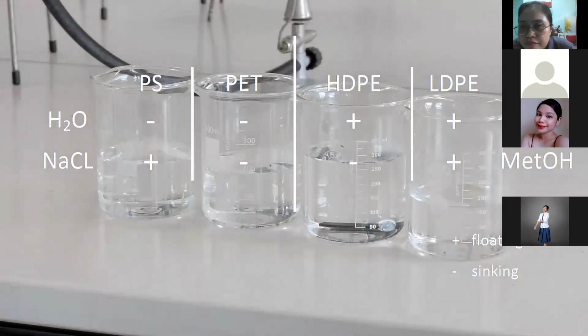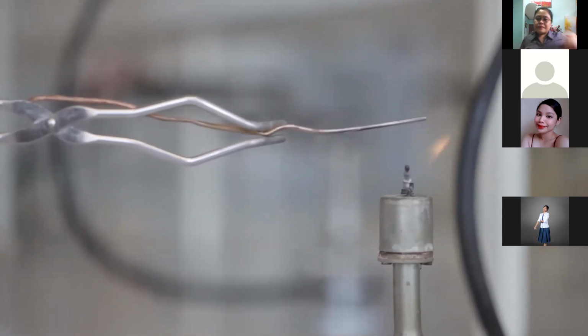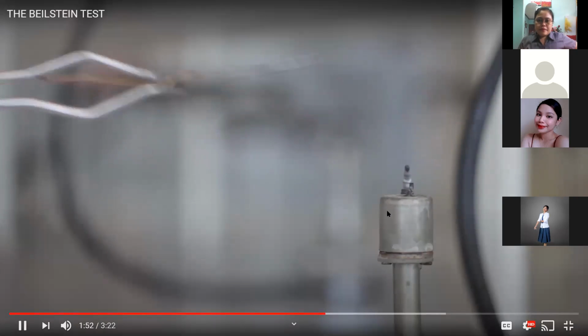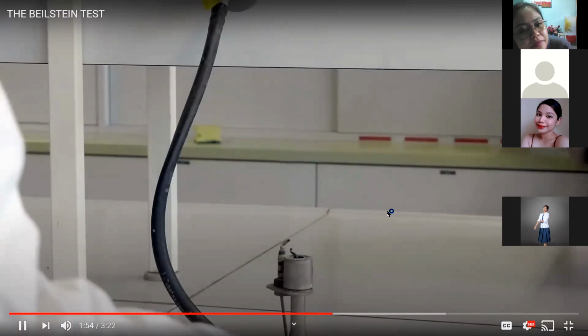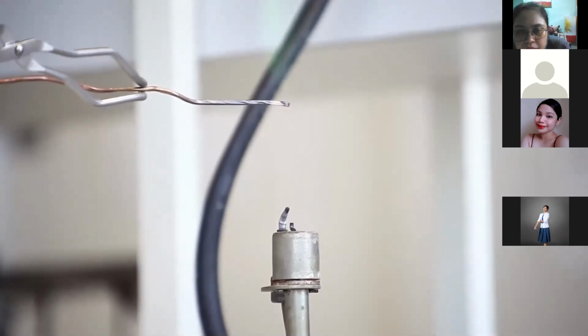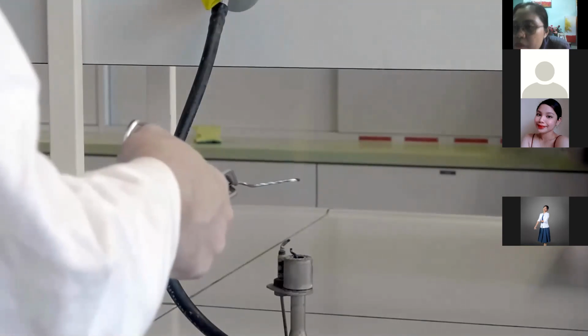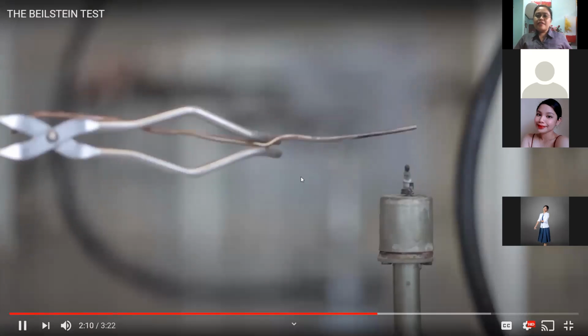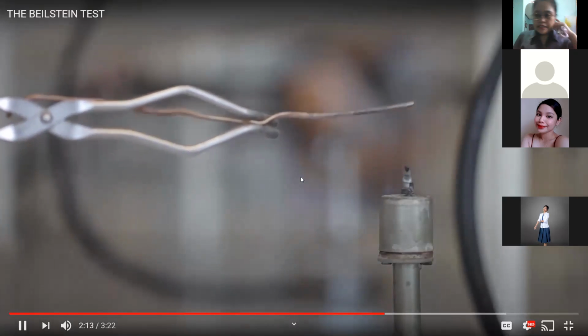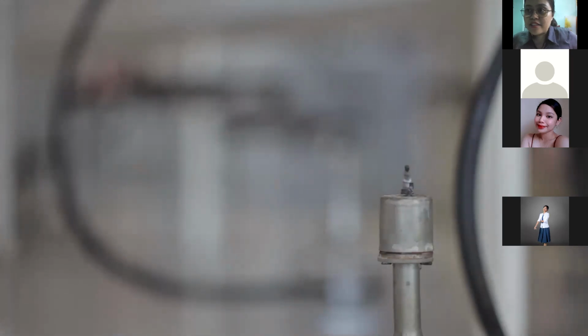Now to the Beilstein test. At the beginning of the experiment, we anneal the wire with the Bunsen burner to oxidize the copper to copper oxide. Then we put the hot wire on the PVC sample for plastic pyrolysis. When we hold the wire in the flame again, we can notice a green flame coloration caused by the chlorine in the PVC, which reacts to copper chloride. That's chloride. For the other polymer, the flame doesn't change color to green. The green is an indication that it has a halogen, and to be exact, it's chlorine.